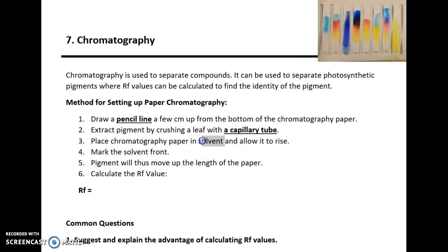Then the solvent front needs to be marked, and that's the distance that the solvent will travel at the top. Mark the solvent front, then the pigment needs to be placed there and the pigment will rise up the length of the paper.